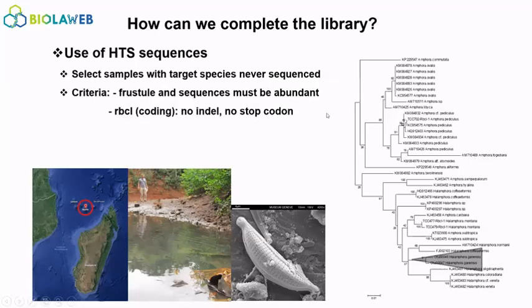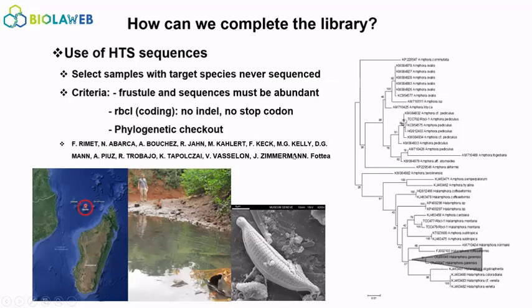So what we did, in fact, is join the microscopy to the DNA, and you can make a phylogenetic check. So you can insert this environmental sequence in the phylogeny. And here it's okay because it's really in the group of Alamphora. So we can associate this sequence to this nice Alamphora organism without uncertainty.